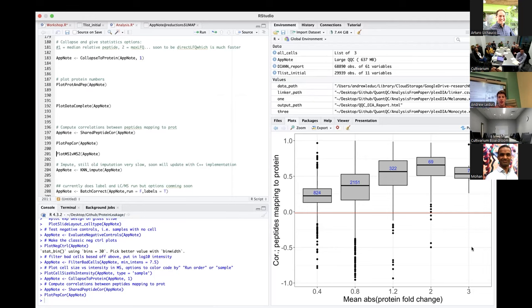But generally, if you're measuring two peptides from the same protein, they should more likely than not agree with each other. Of course, there are all sorts of edge cases that are really interesting. And maybe some of these data points down here are interesting things. Maybe there's a high fractional site occupancy of phosphorylation, and this protein down here has two peptides, and one of them is phosphorylated most of the time, and the phosphorylation state changes from the regular. So they're not all interesting; I would reckon a lot of these are just noisy data, but some of them might very well be interesting things.